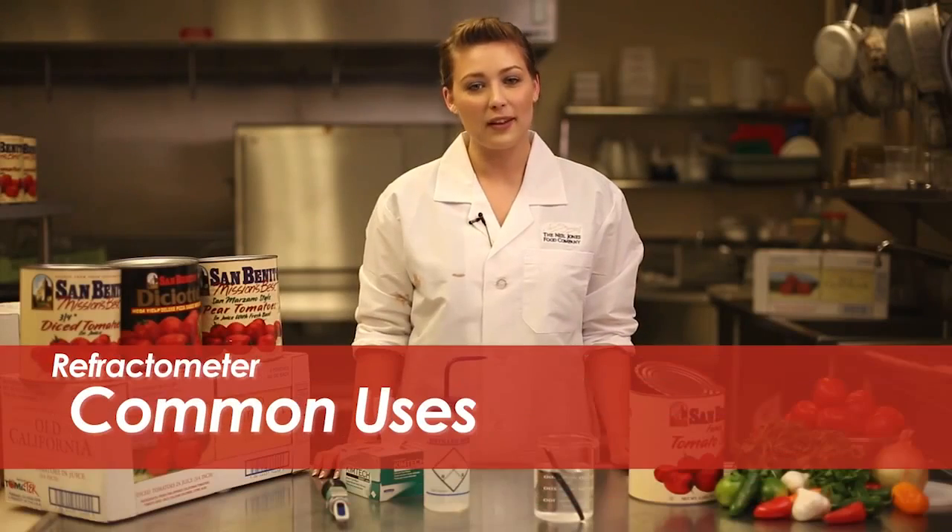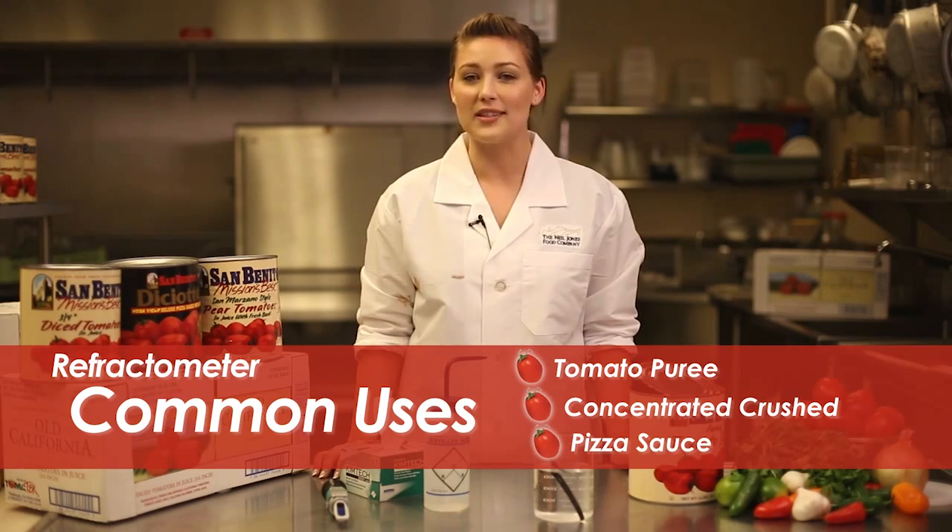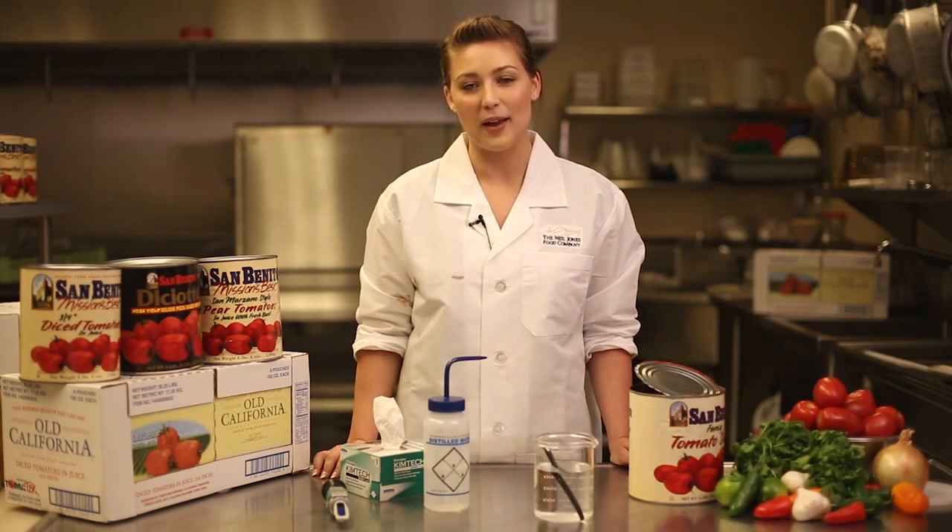The refractometer is typically used on products such as tomato puree, concentrated crushed, and pizza sauce to determine solids of a product. This helps you determine which Neil Jones product best fits your needs.